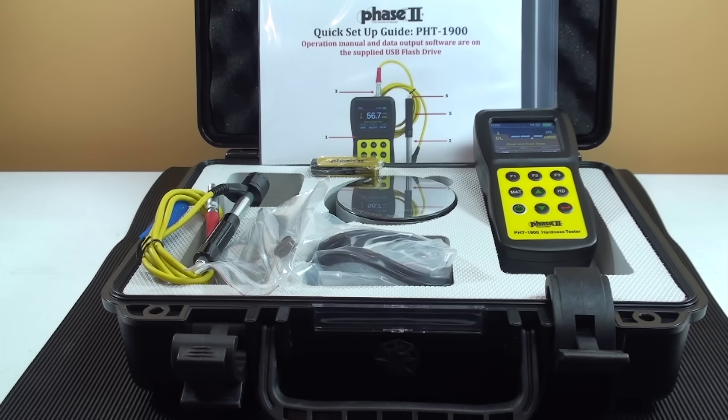This is an instructional video detailing the applications and functions of the Phase 2 PHT1900 Portable Hardness Tester. The PHT1900 is designed to test metals, primarily large parts of steel, cast iron, aluminum alloys, and copper alloys.